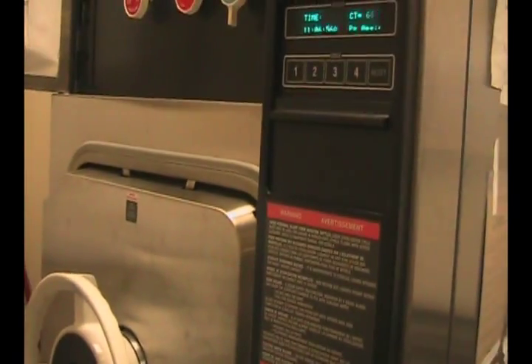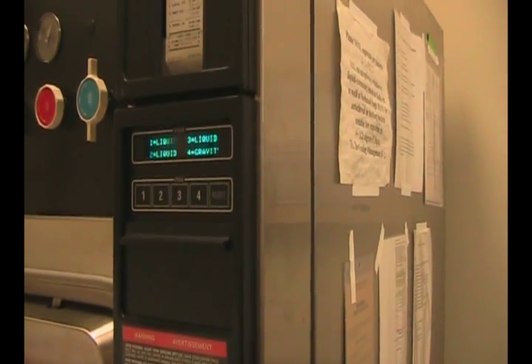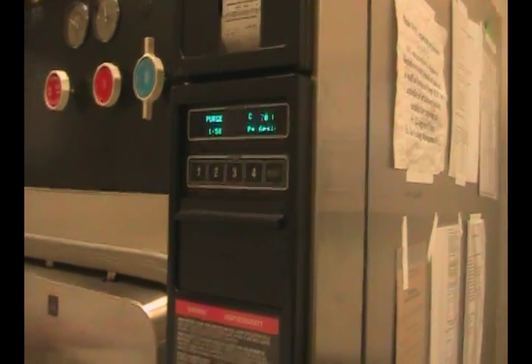Now that it's properly sealed, we can go ahead and select our cycle. We're going to use cycle one. Go ahead and press the button twice, and the cycle will begin.